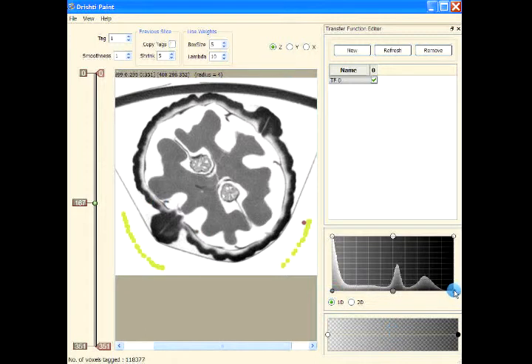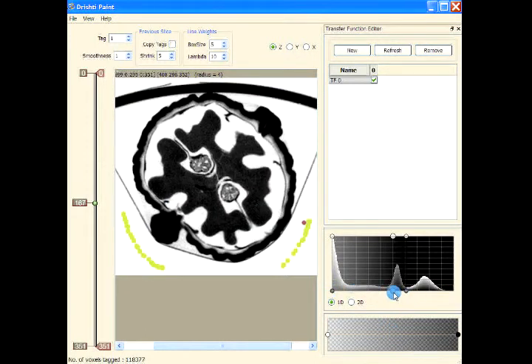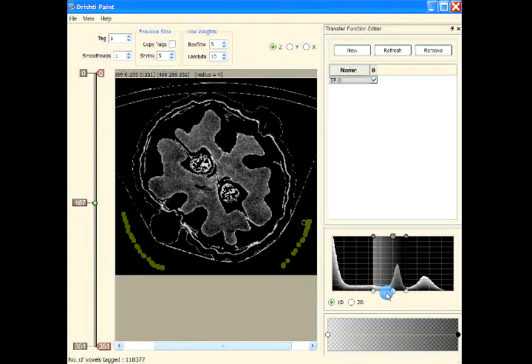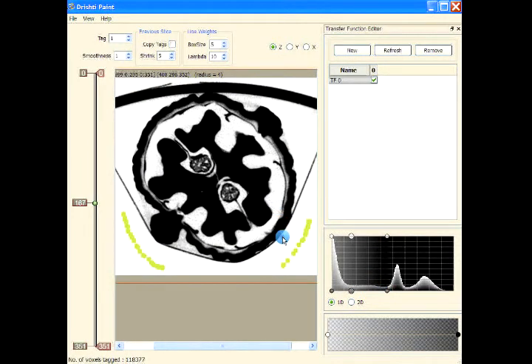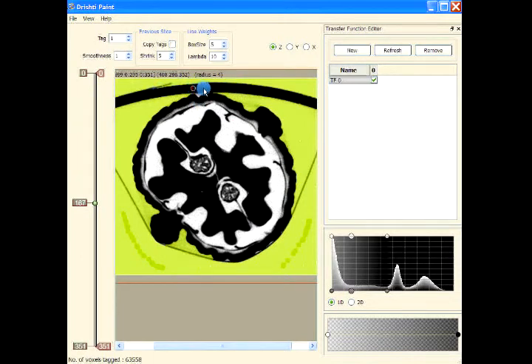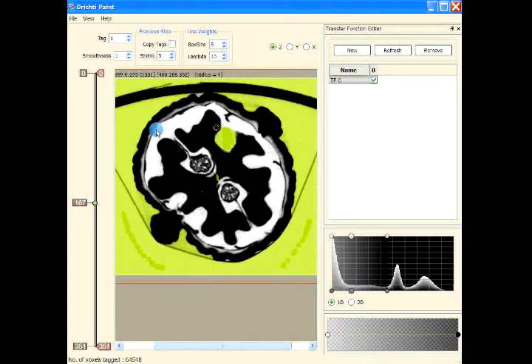If I want to restrict the tagging, I can tag just the boundary region. As you can see, the boundary gets tagged. We can't paint over the high-intensity region because it is transparent in the transfer function. We can tag along the boundary and so on.